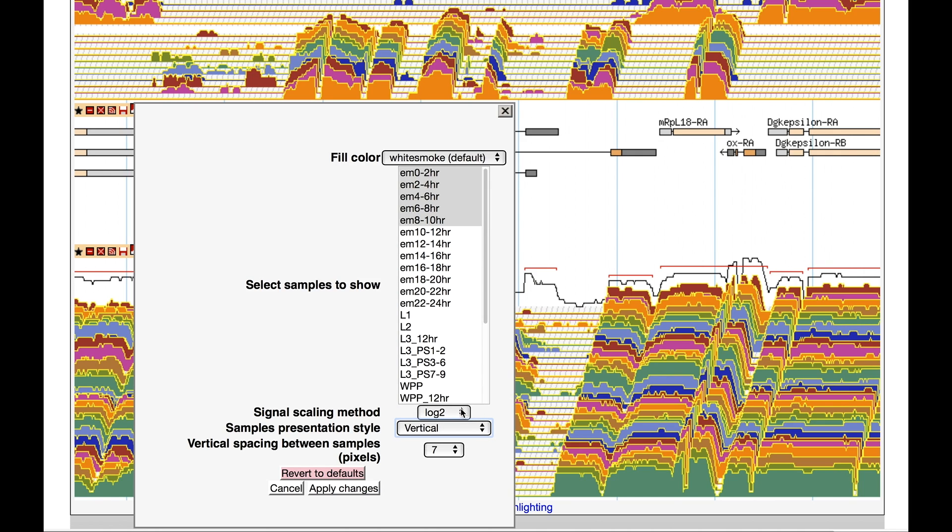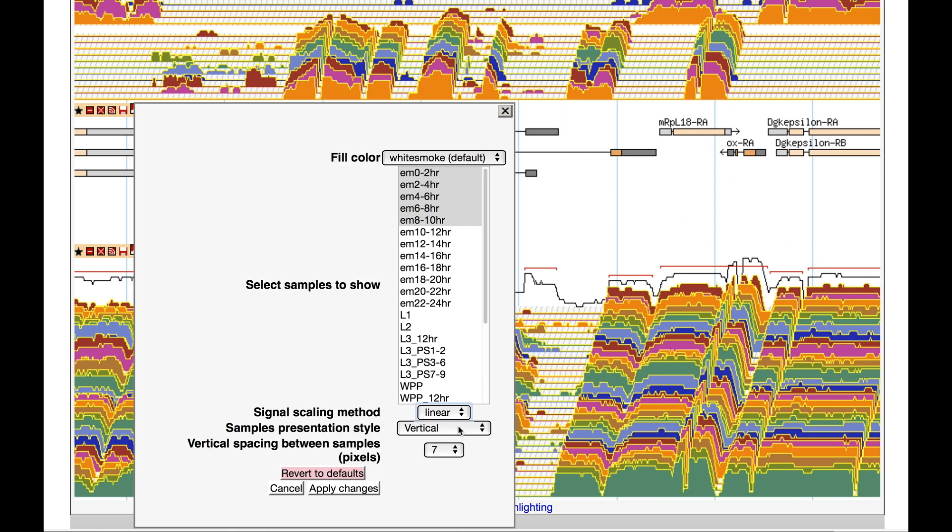Finally, you can change the scaling method from log2 to linear. Log2 has been chosen as the default since it allows the best representation of a wide range of expression from very low to very high. A linear scale often provides a better comparison of changes in expression from one gene across different samples.